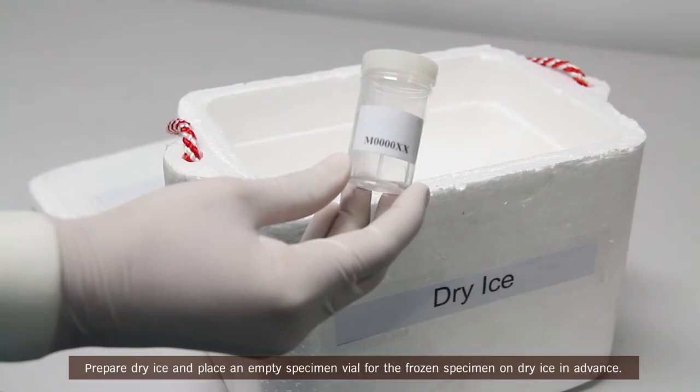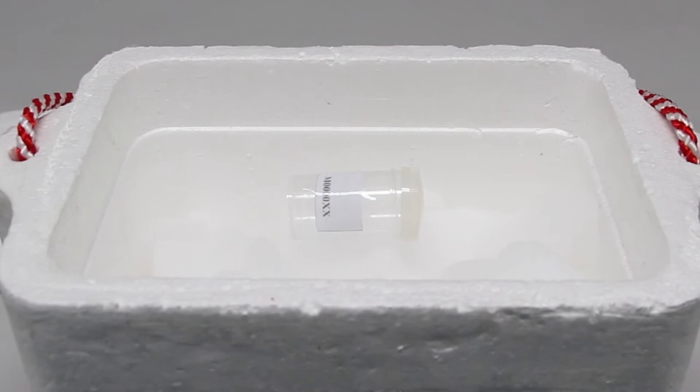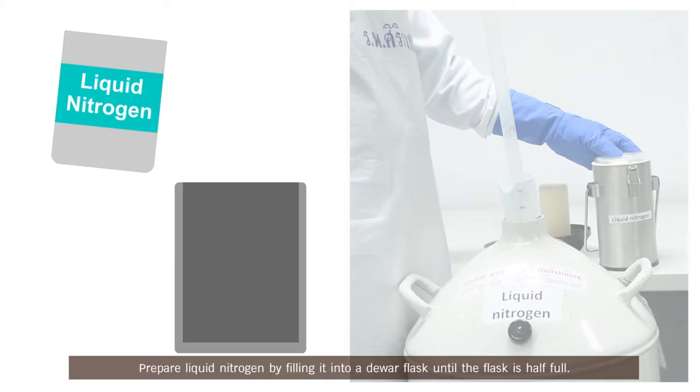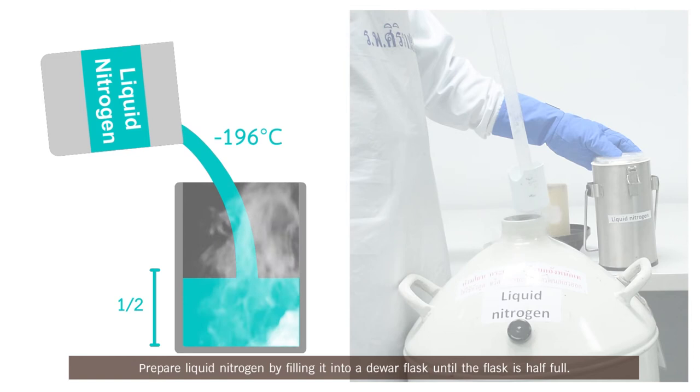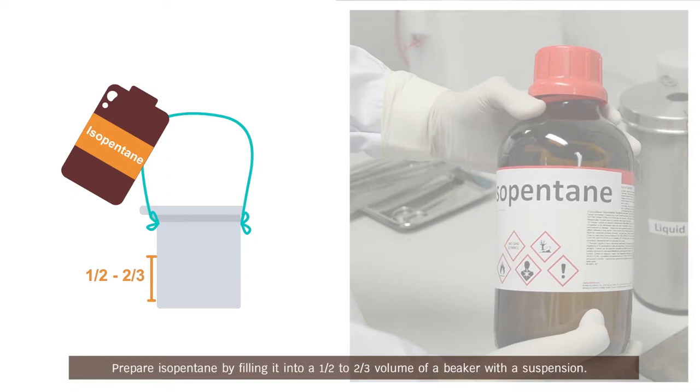Prepare dry ice and place an empty specimen vial for the frozen specimen on dry ice in advance. Prepare liquid nitrogen by filling it into a dewar flask until the flask is half full. Prepare isopentane by filling it into a half or two-third volume of a beaker.